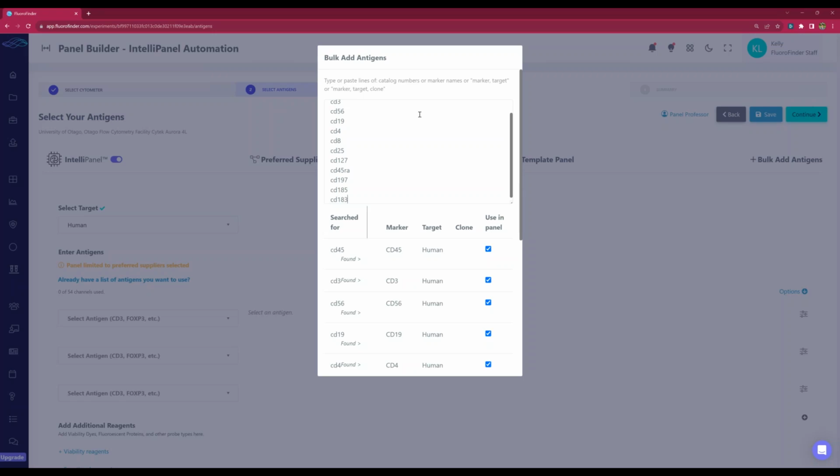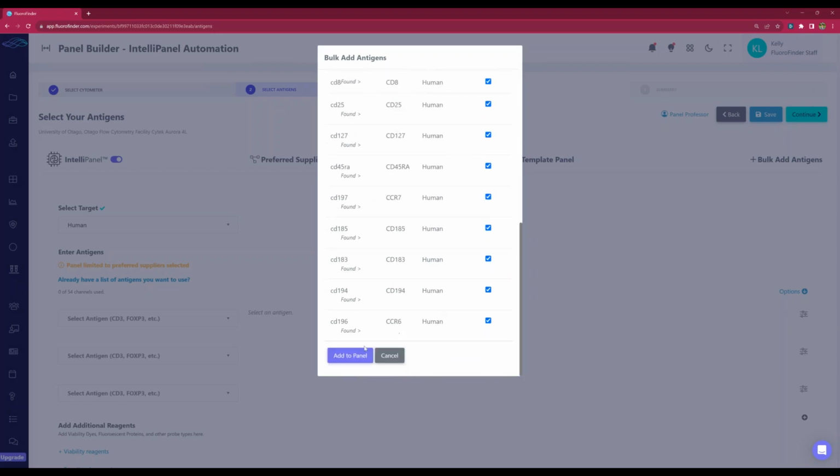So you suggest having the same instrument listed with a different configuration, is that right? Mm-hmm. Yeah, I have a friend at Salk that does that. She's got one instrument where people regularly change out one of the filters, so you could just give them 2 different names, depending on what your needs are.